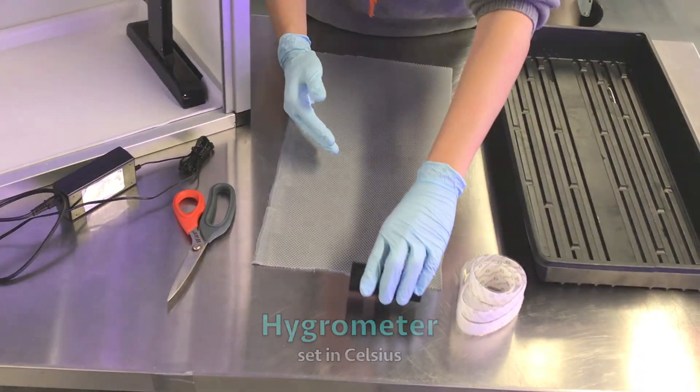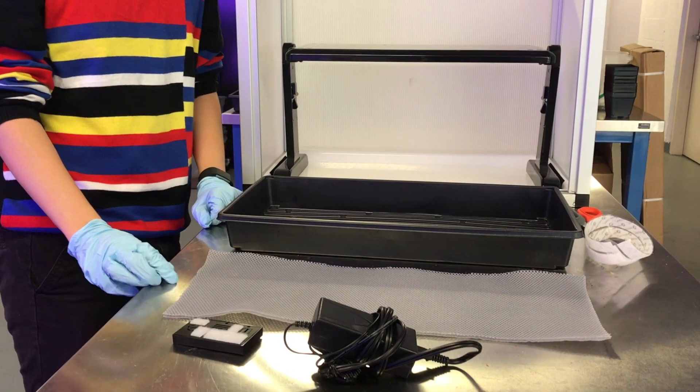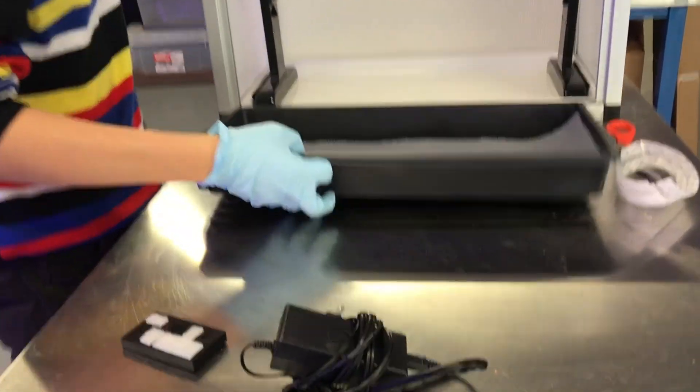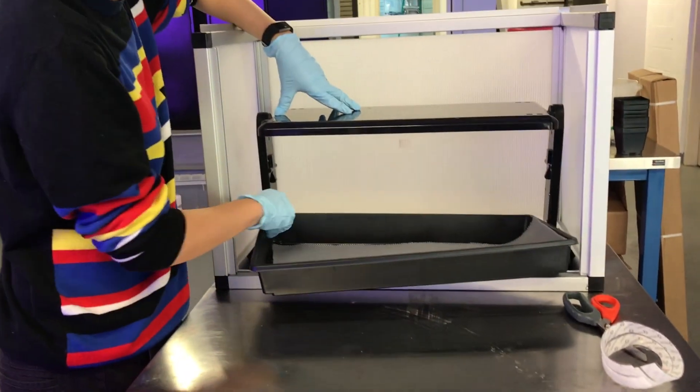Finally, a hygrometer. Make sure to have it in Celsius. Place the wick fabric material on the tray and place the tray in the box under the LED lights.